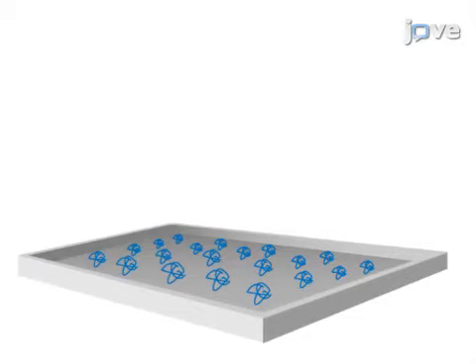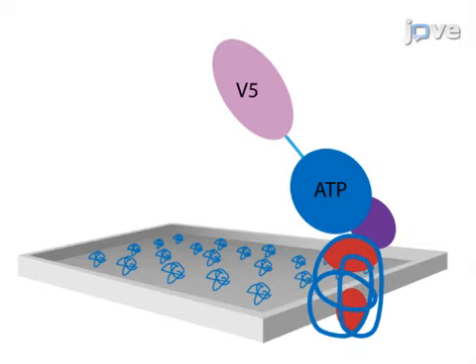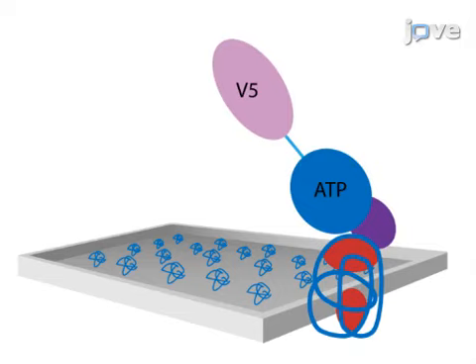This is accomplished by first hybridizing an epitope-tagged protein of interest with the highly purified full-length functional protein library deposited in a coordinate plane on the surface of a microscope slide.